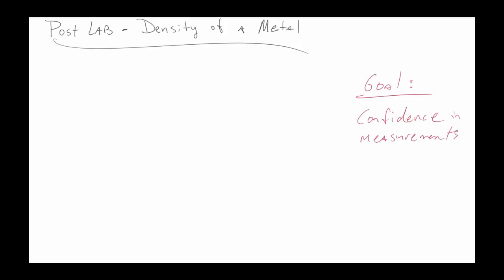Now remember, with us, all of this really started when we were looking at the equipment, whether or not we were going to be able to identify what the increments were. Because remember, the increments were actually able, when we looked at them and determined what they were, to tell us to what digit we would be able to read a piece of equipment to and be confident about all of those digits, right? And we actually went one step further.